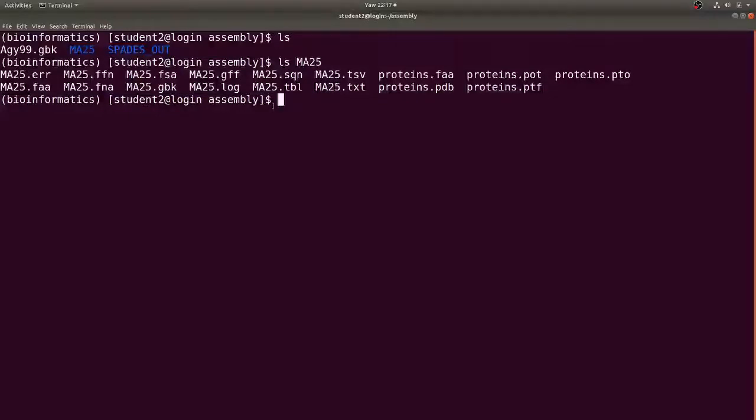Of course, I'll give the link to the Prokka homepage. You can check the meaning of these files. Each of them stores a particular data format. Some store datasets for genes, some for annotations, log files, and errors. Okay, so those are things we need. So I'll just quickly go over how we interpret the annotation. This file stores the coding regions, the .ffn stores the genes, GenBank stores the annotation information, and then others. So to interpret your annotation, you need to know what you are looking for, and you need to know which files that information can be found in.